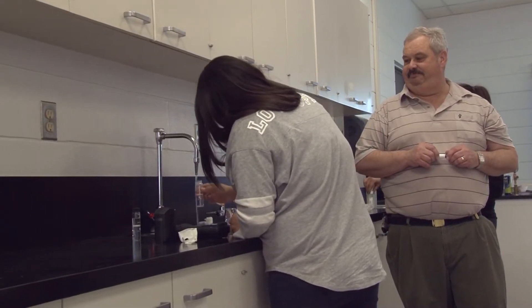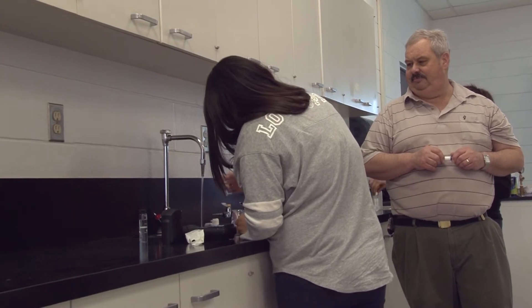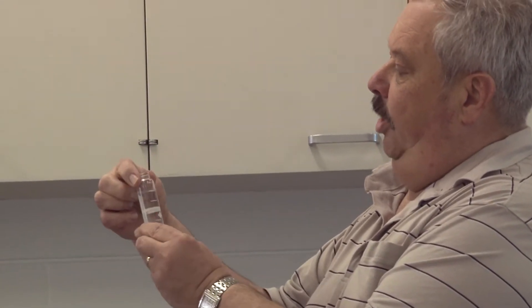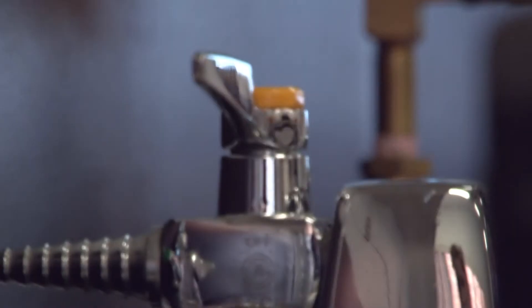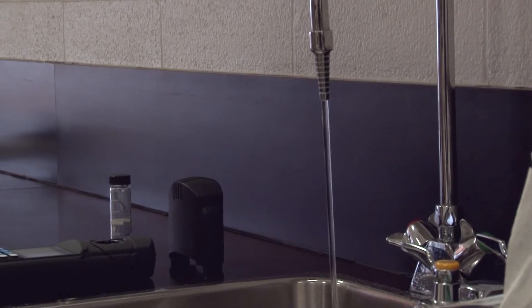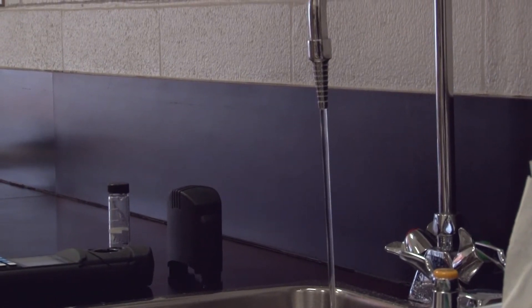This test requires a 25 milliliter sample. 25 milliliters is marked right here on the bottle — it can be a little bit above or below, it's not critical. Make sure your tap is run long enough to get a composite sample that is representative of your distribution system.